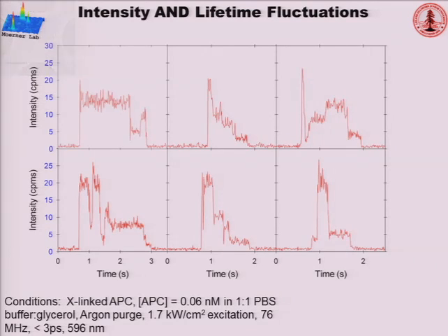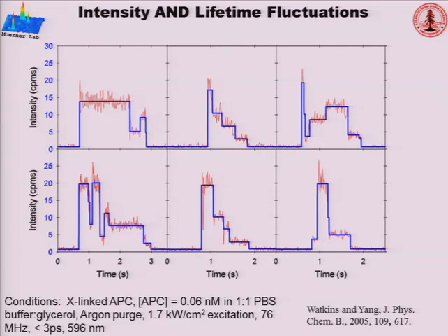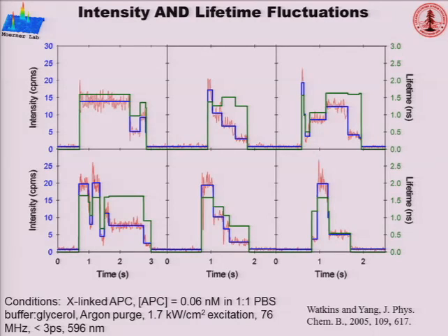All right, so what do we see? We see many plateaus. We can then highlight those plateaus using a change point finding algorithm described by the guy who's giving the talk after me. And that's what I'm showing in blue. We can do one more step also. Because we're using a pulsed excitation and we're doing our recording by time-stamping every single photon in the process of time-correlated single photon counting, we can extract lifetimes and assign a fluorescence lifetime for each one of these intervals.